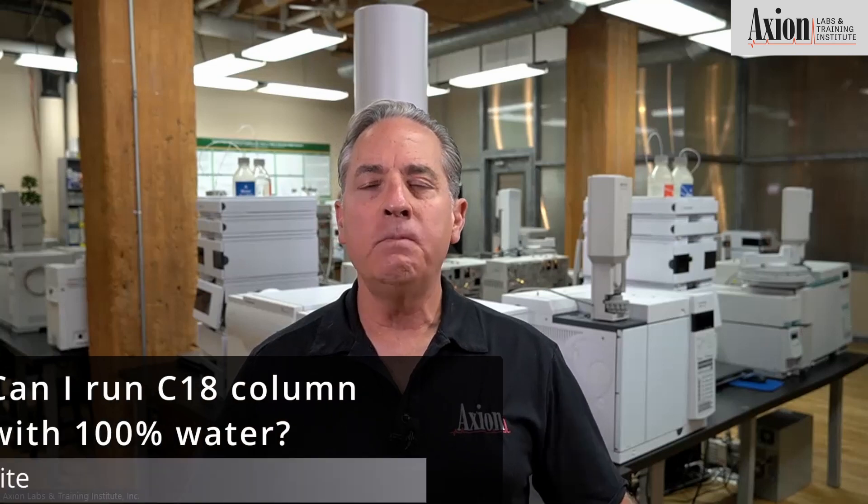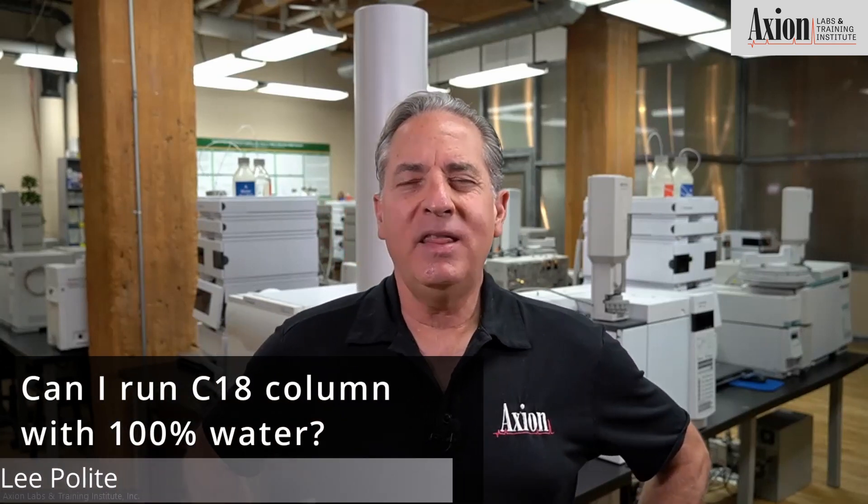So you're running your C18 column — my favorite column, the number one column out there. You're wondering: can I run it with 100% water? The answer is, we don't recommend it. And here's the reason.